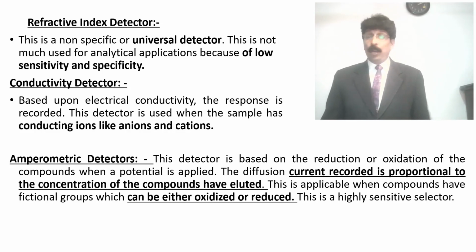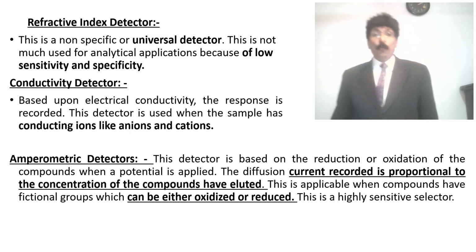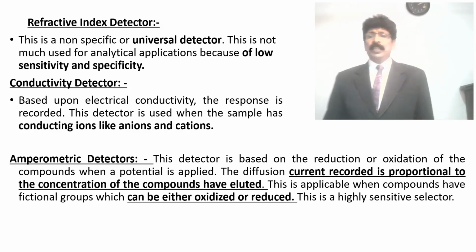This is a good principle which is followed for the amperometric detector. It is applicable for compounds having a functional group which can be either oxidized or reduced. This is a highly sensitive detector.